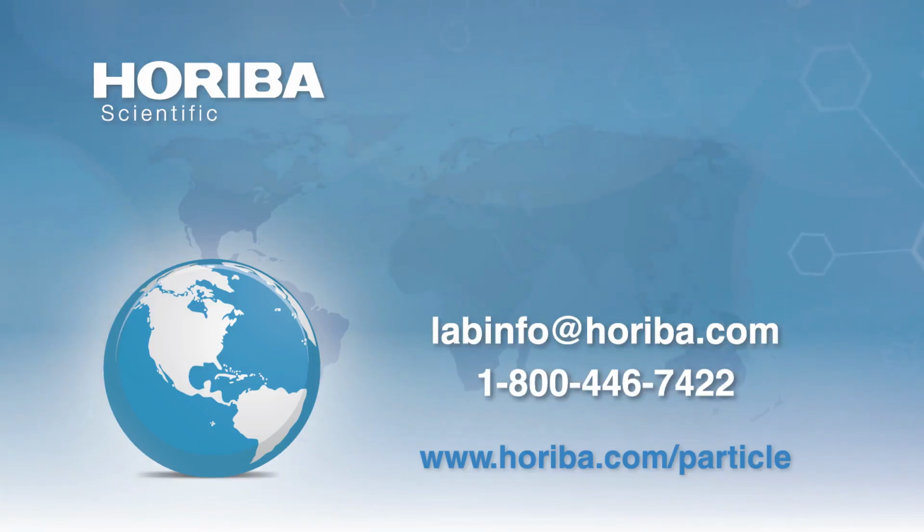So, question: can the ViewSizer analyzer be used to detect EVs labeled with fluorochrome conjugated antibodies in a similar way that flow cytometry does for antibody labeled cells?